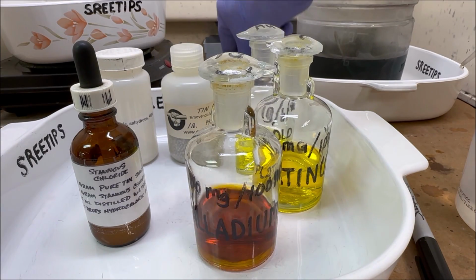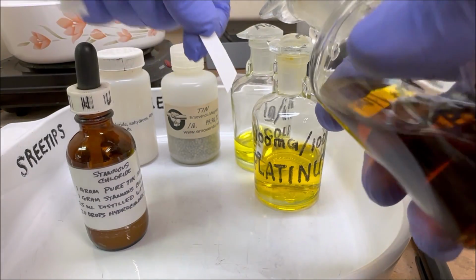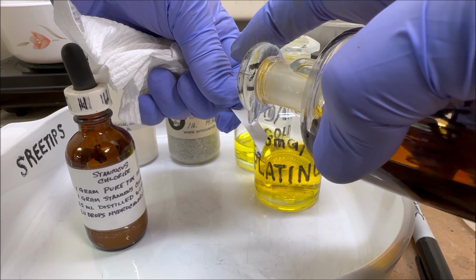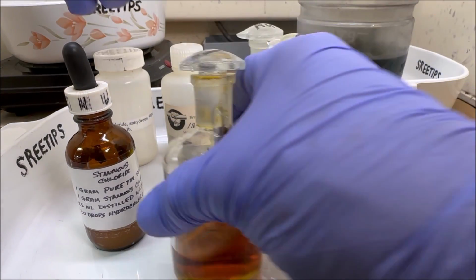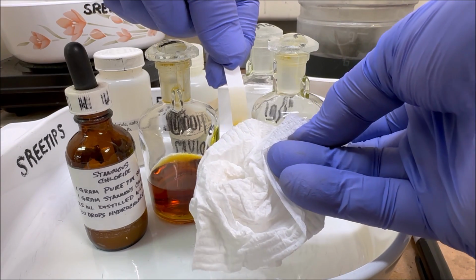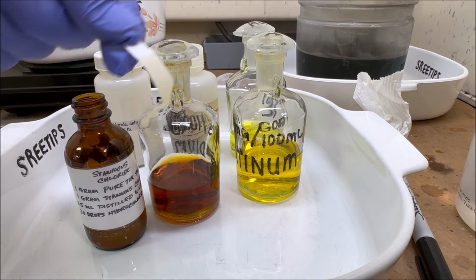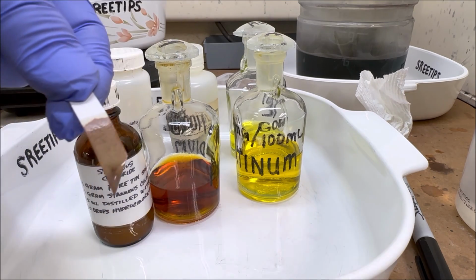Let's try one more test. I have some palladium test solution here. These are standard test solutions that I can use to make sure that my stannous chloride solution is going to work properly. And these standard test solutions also give me some indication of the concentration of metals that I have in solution, because these are a known quantity, 100 milligrams per 100 milliliters. All right, let's look at this palladium test. There's the palladium test.